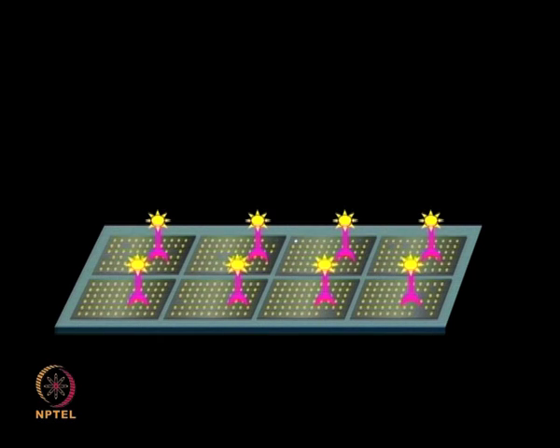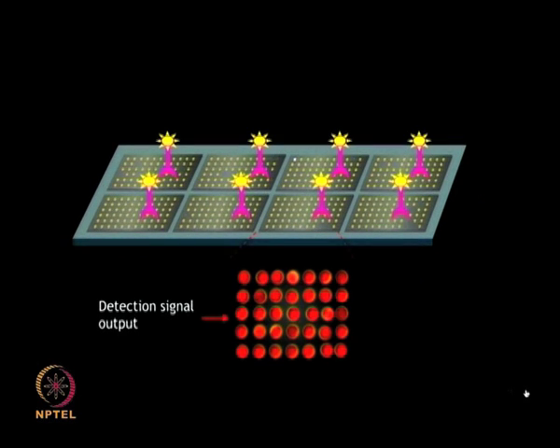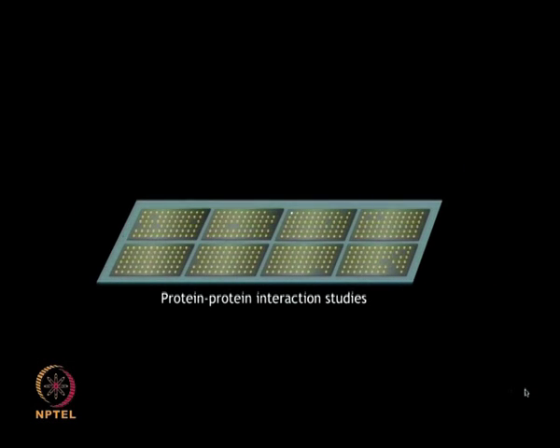The chips were probed with anti-GST antibodies to determine the reproducibility of protein expression and immobilization. This shows the uniform signals across the whole proteome array. The signals were observed for more than 90% of the proteins, and over 90% of the features contain 10 to 950 femtograms of the proteins.